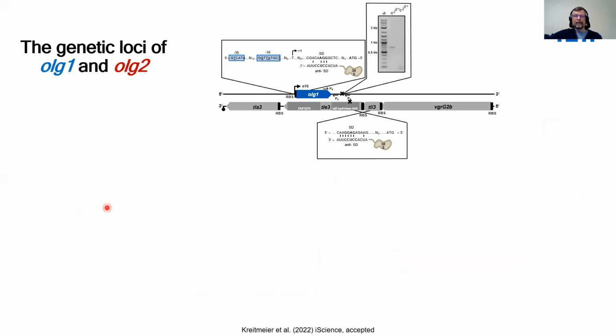Okay, so here is a genetic locus. We did promoter analysis, looked at where the transcriptional stop is, and so on, and looked at the whole locus. Here are the annotated genes on the genome, and here's this novel open reading frame where we have now confirmed not only by messenger RNA sequencing and ribosome profiling, but also by mass spectrometry that this thing is producing a protein. And this one also. So both genes on both sides of the DNA strand produce protein.